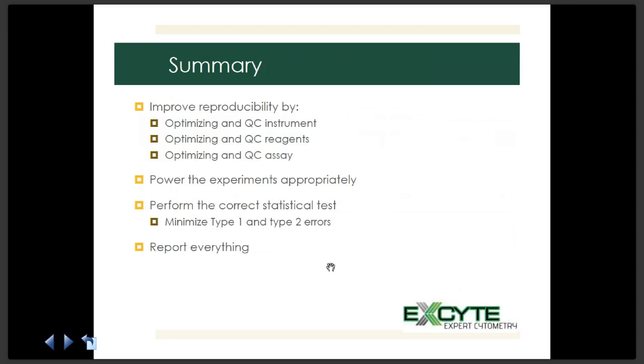Take advantage of the MIFlowCyt standard, take advantage of the Flow Repository so that people have access to your data and can look at that and look at the conclusions you drew off the same data.